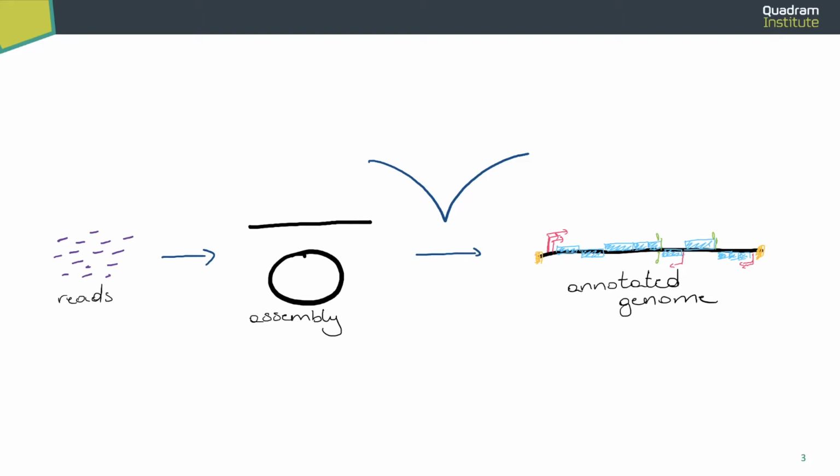we'll have a closer look at some of these steps. The first thing we need to do once we go from the assembly and have our contig, before we do our actual annotation, is try to find the genome ends, because you want to have your phage genome complete and in the correct orientation before you do a lot of steps that you would have to repeat if you don't have the correct genome organization.